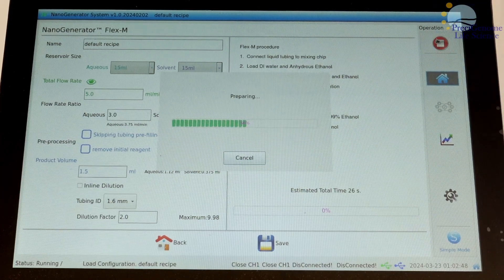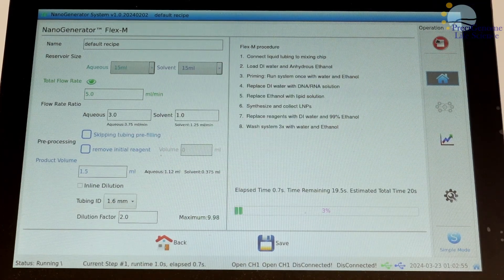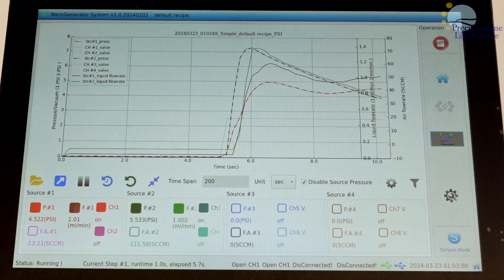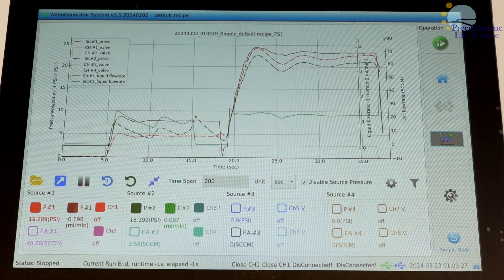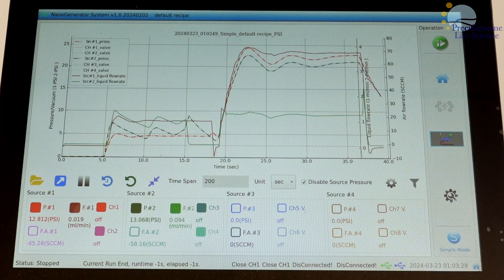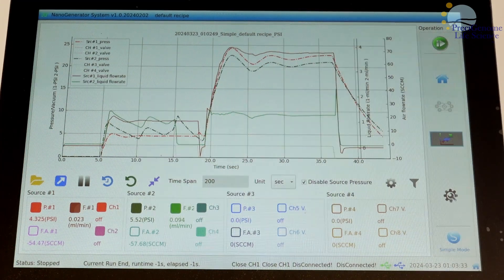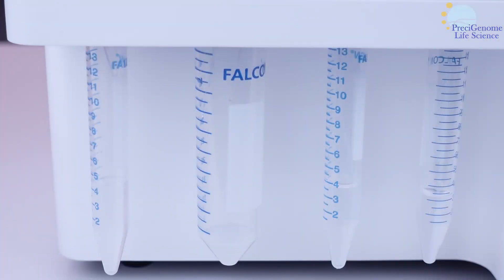After executing a recipe, you may monitor its live pressure and flow rates. The live feed lets you toggle which parameters to track, load previous assay results, export detailed analyses to a flash drive, and more. A typical recipe will be completed within seconds to minutes. From here, you may disconnect the collection reservoir to access your product.